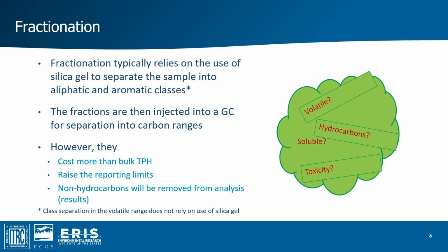Although the fractionation methods can provide detailed information, they do cost more than bulk TPH. They will remove non-hydrocarbons from the analysis, and there will be raised reporting limits.